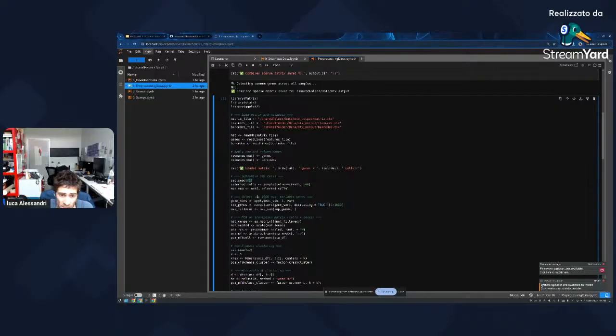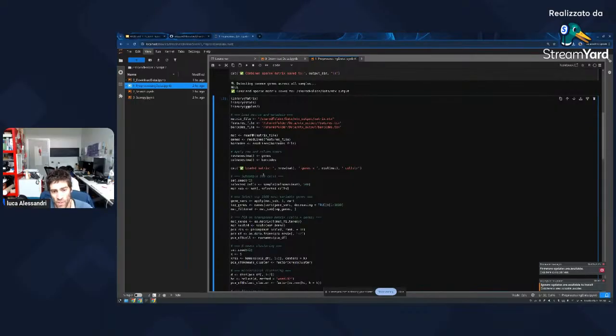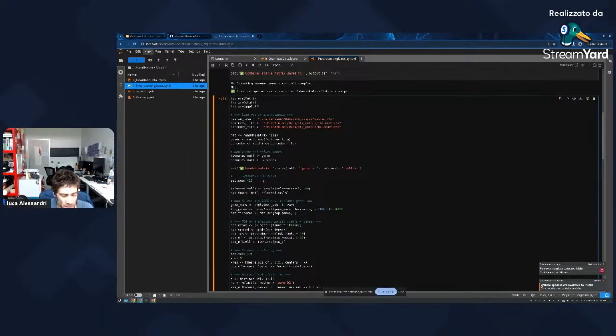What does that mean? That means that if I run this code today and I give you this code and you run this code, and in this code there is a random number, okay? So here, I don't know actually the random function in R, which one it is, but if I ask R to give me a random number through a random function, maybe it's rand, and then I say, just give me one number, this value will be the same on my computer and on your computer. But if you don't set the seed, well, this value will be different. So this is the reason why.